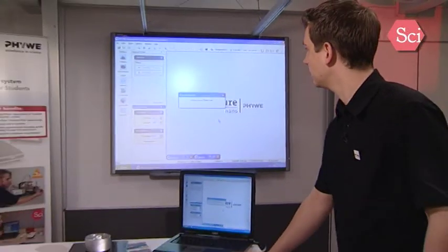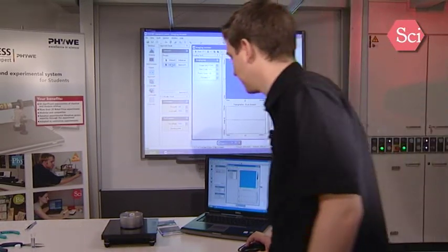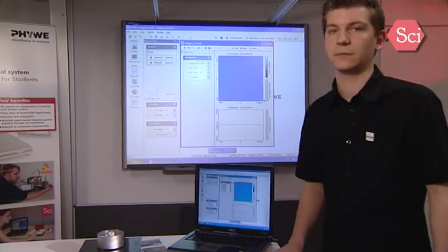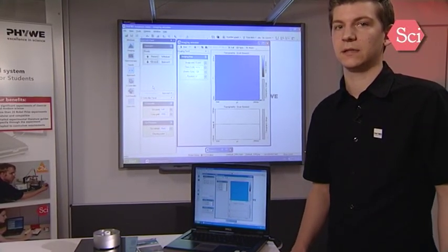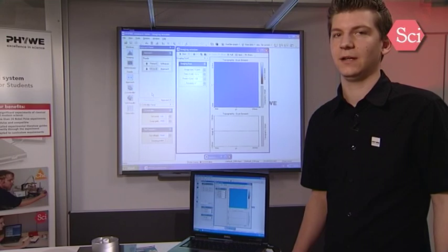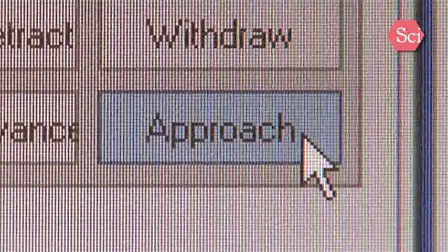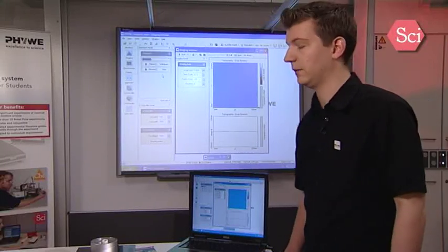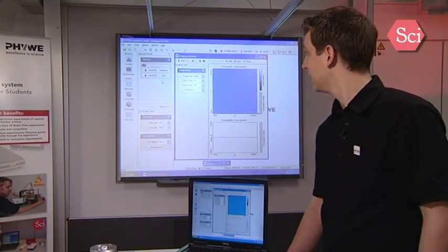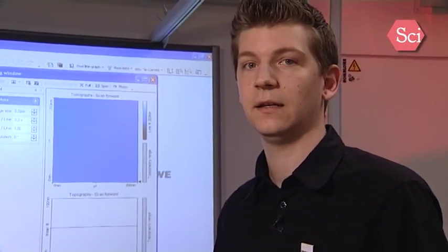We will now use the approach panel to bring the sample towards the tip. Press the advance button. Always check the distance between the sample and the tip. In the sample surface you will see the mirror image of the tip. When the real image of the tip and its mirror image approach at a very close distance, you can use the automatic final approach to start the measurement. The system will now drive the sample towards the tip, and when it reaches its preset set point of the tunneling current, it will stop further advancing and start the measurement right away.